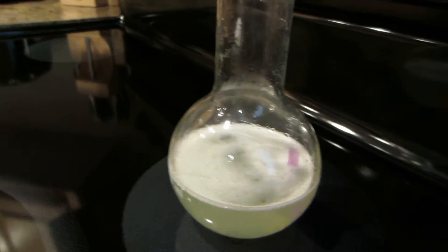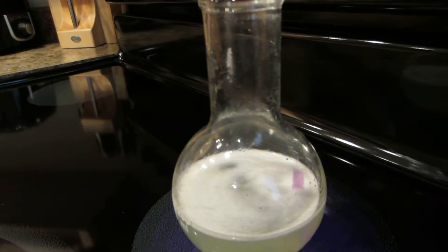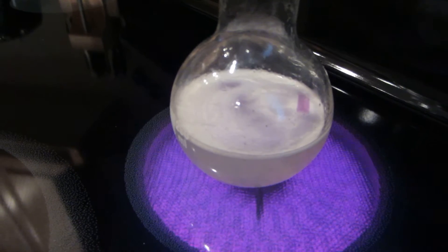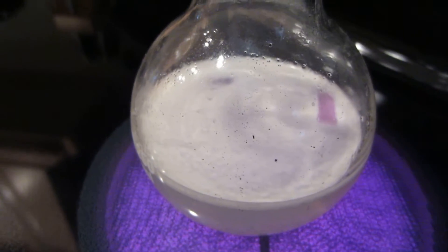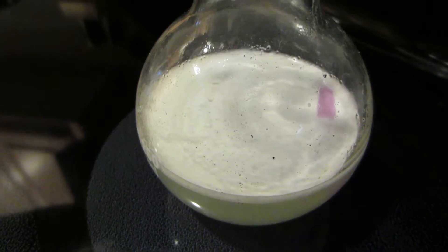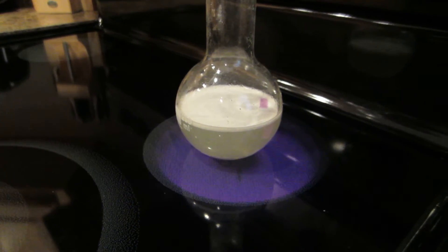It's starting to run out. Is there a litmus paper in there? Yeah. Let's see if there's acid after. Yeah, it's fine. It's fine. It's fine.